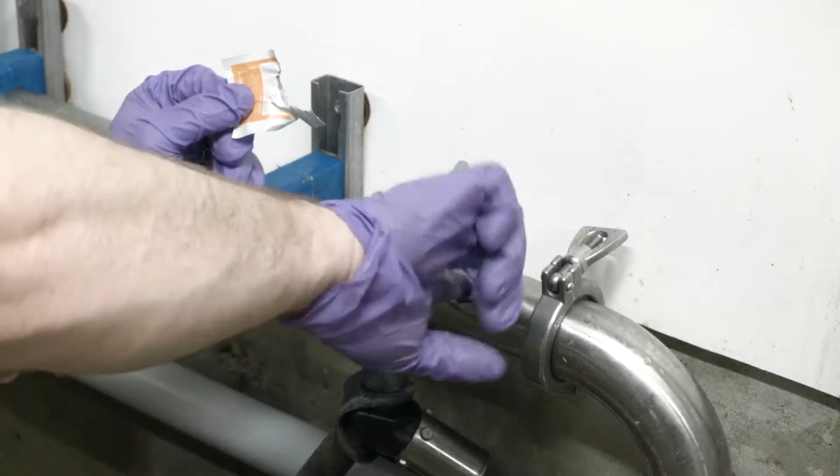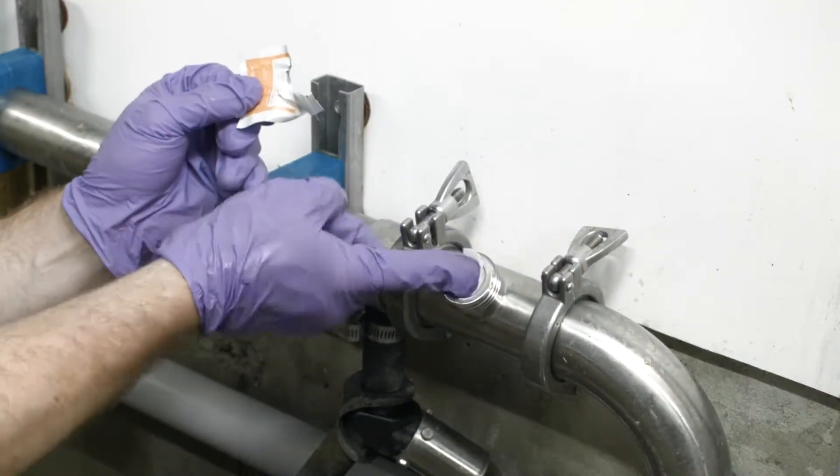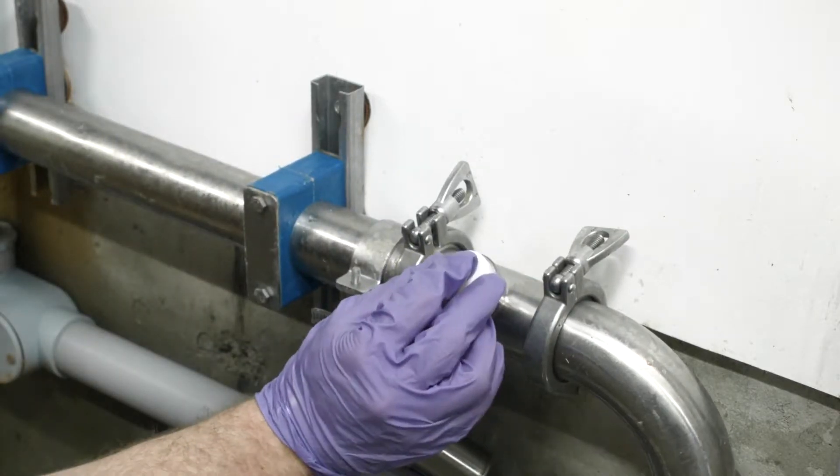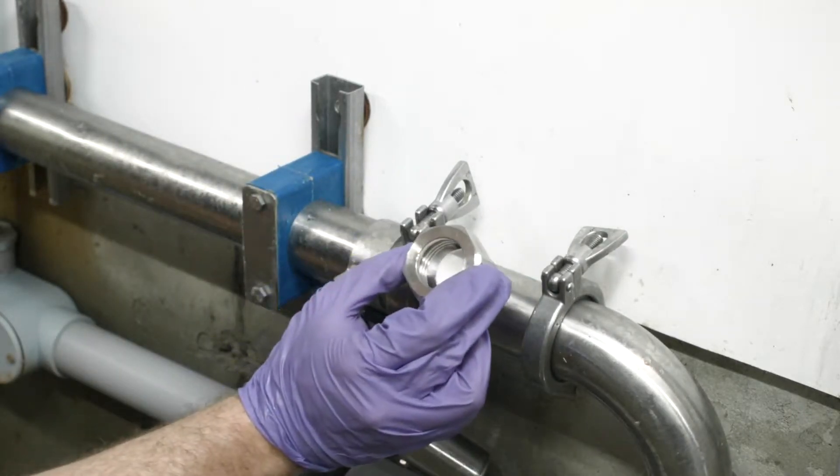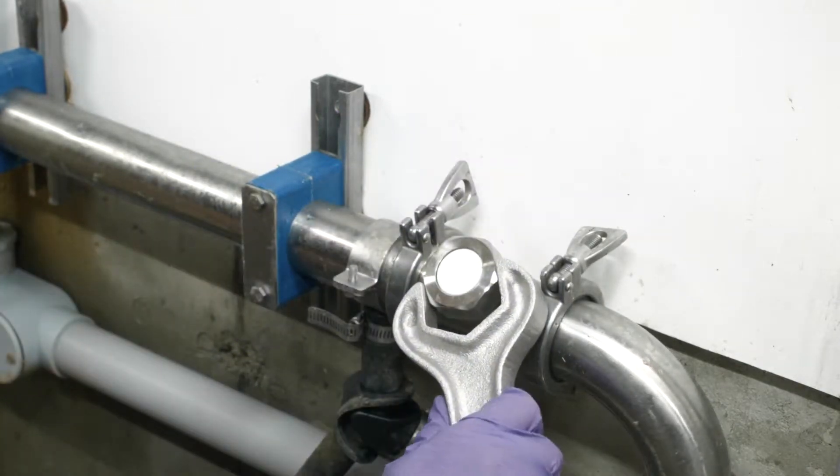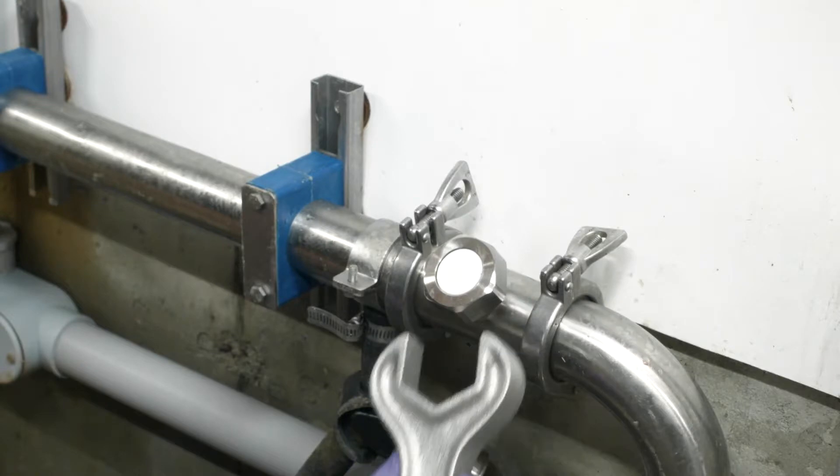With an alcohol-saturated swab or alcohol wipe, clean the inside of the stainless steel port. Place the septum into the stainless steel port and then tighten the nut over the septum. Hand-tighten the nut, then tighten it one-eighth turn with a wrench.